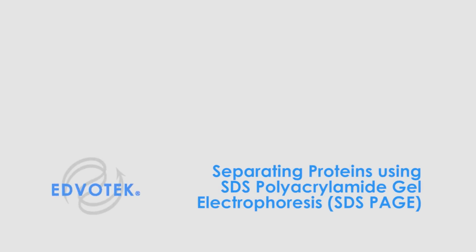Edvotek instructional videos. Separating proteins using SDS polyacrylamide gel electrophoresis, also known as SDS-PAGE.